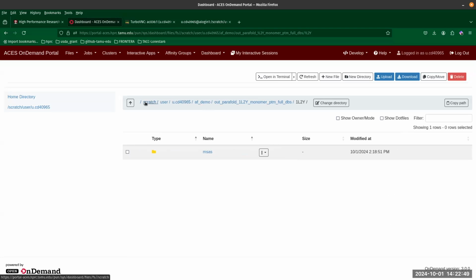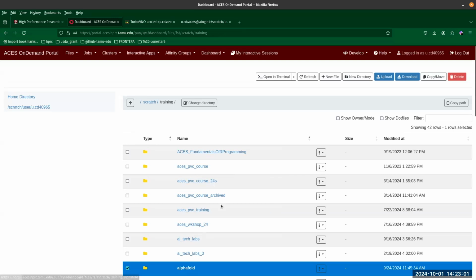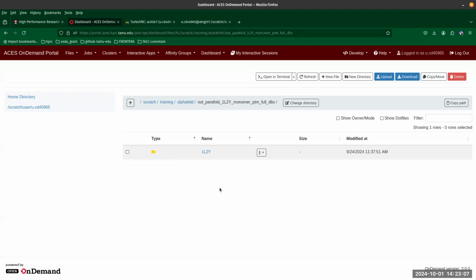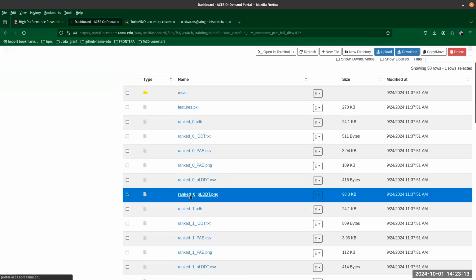Sorry, I gotta go back to the shared. Looks like my job started, but let's go to scratch, training, AlphaFold, out, 1L2Y, rank 0 pLDDT PNG.